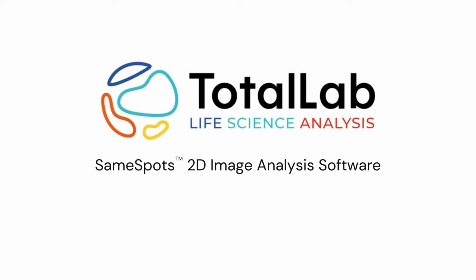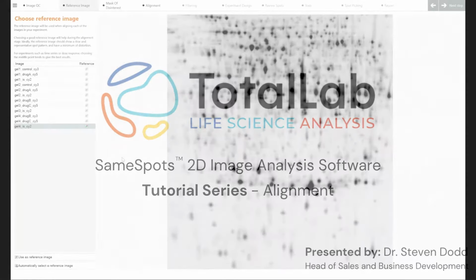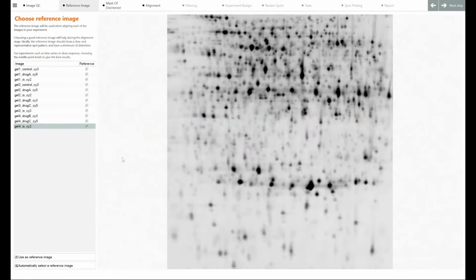Today I'm going to be speaking to you about how alignment is performed within our 2D analysis software SameSpots. The first step in aligning your 2D gel and blot images within SameSpots is choosing a reference image.